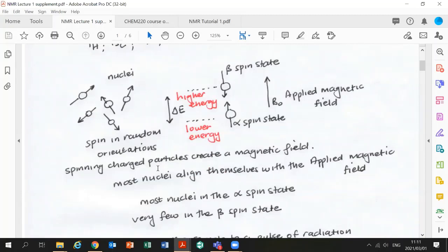All right, so let's spend a little bit of time on this particular diagram that I've put here to show you what happens to this nucleus. And I'm going to forget about the carbon, fluorine, phosphorus, nitrogen nuclei, and I'm just going to concentrate on protons. Remember that NMR first started using protons, with just 1 proton in the hydrogen atom. Each of these balls I've drawn represents a hydrogen atom with 1 proton in it. And the arrow shows you the direction in which they spin.